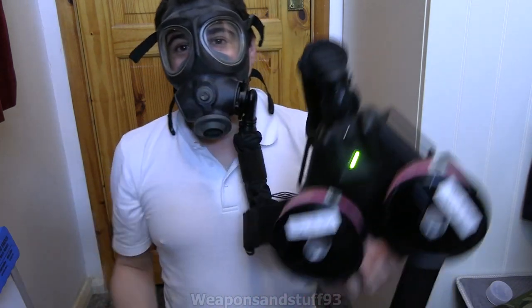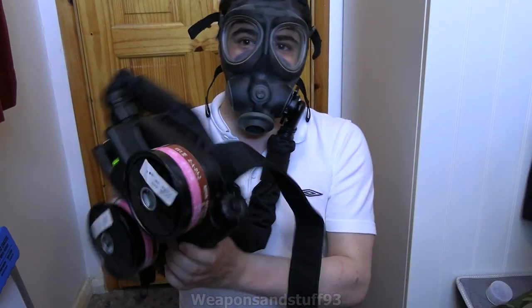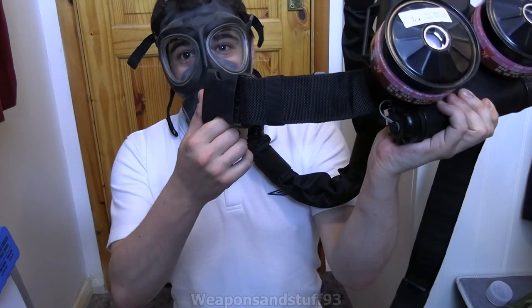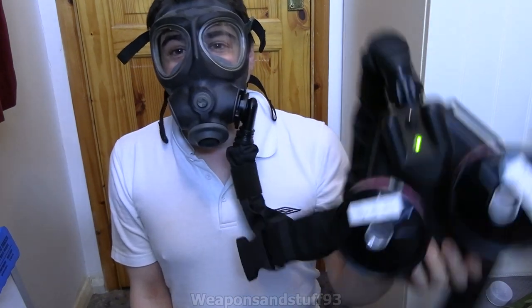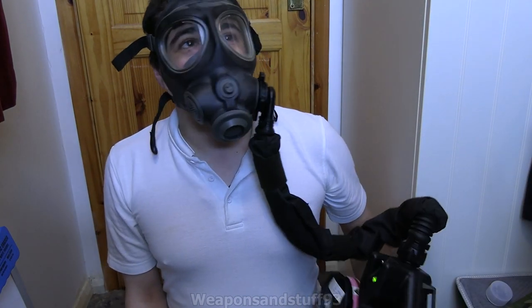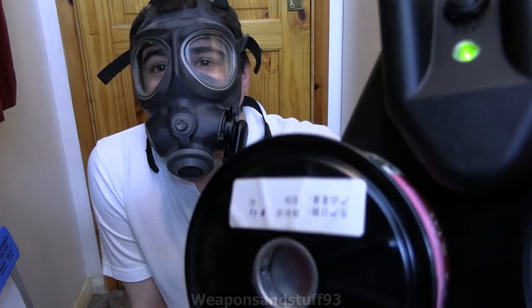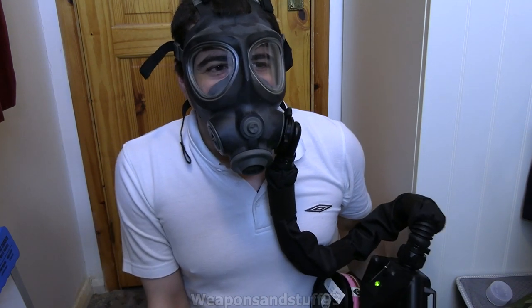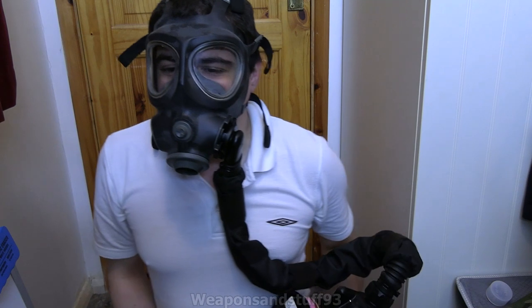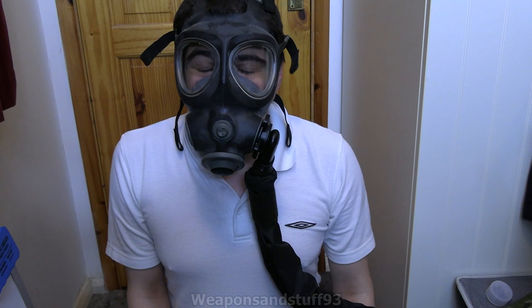That provides a very good airflow. As you can see, the pack isn't that big and heavy compared to some PAPR units. You can have that on a webbing belt. I can certainly see why C420s are popular. The main thing is it's not all that loud, as you can probably hear, which is probably the big military appeal behind the C420 — you're not going to hear it from too far away. It doesn't sound like a vacuum cleaner on steroids like some PAPR units do.